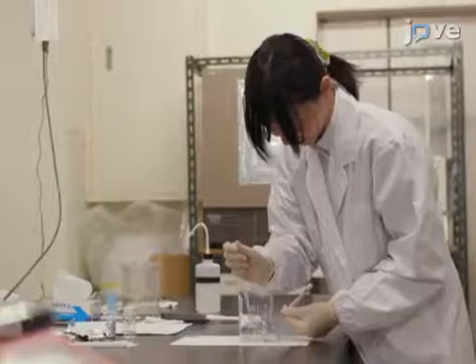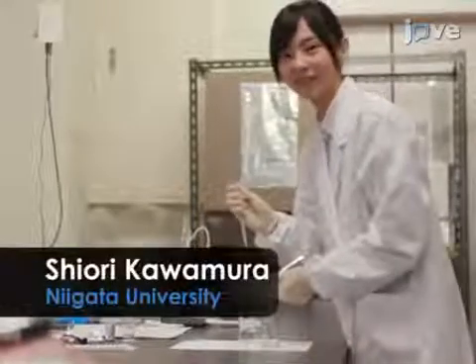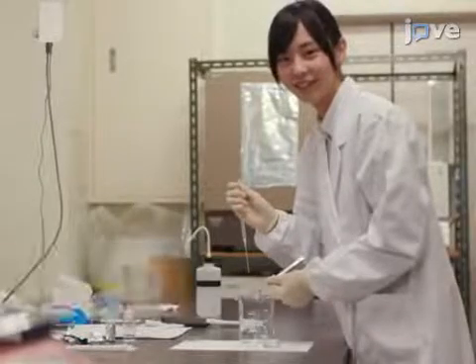The main advantage of this technique is that it provides nanostructured hybrids having good transparency and stability of metal nanoparticles. Demonstrating the procedure will be Shiori Kamura, a graduate student from my laboratory.